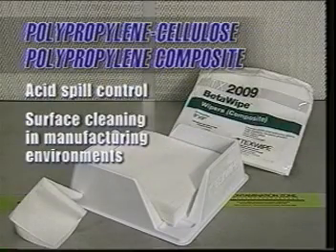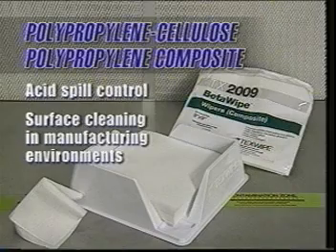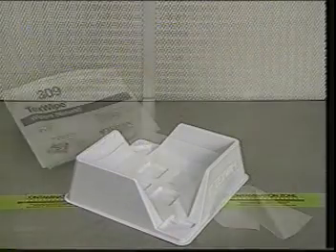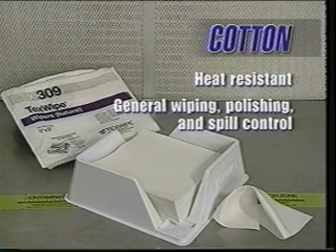In a situation where absorbency is paramount, but low particle and fiber counts are not critical, a wiper made from a polypropylene cellulose polypropylene composite represents the logical choice. And while they can leave behind larger amounts of particles and fibers, wipers made from cotton are sometimes best suited for work around higher surface temperatures, where synthetic fabrics may not hold up well under heat. The bottom line is this: to choose the correct wipers for the job, you must carefully assess their performance characteristics in comparison to the level of contamination your work environment can tolerate. Today's state-of-the-art metrology techniques provide the data that can help you make an informed decision.